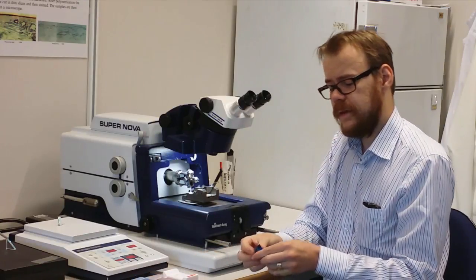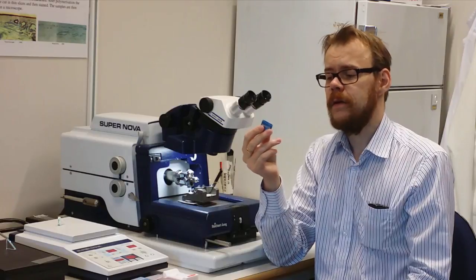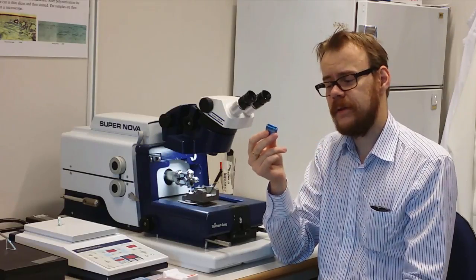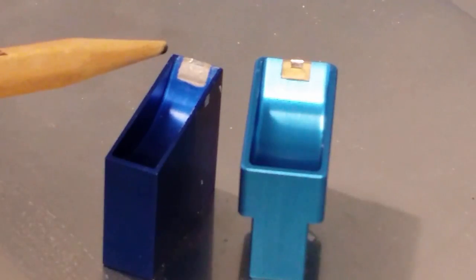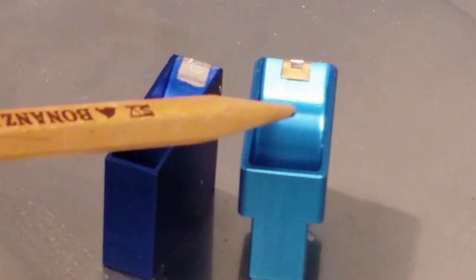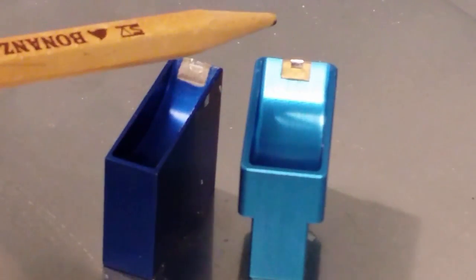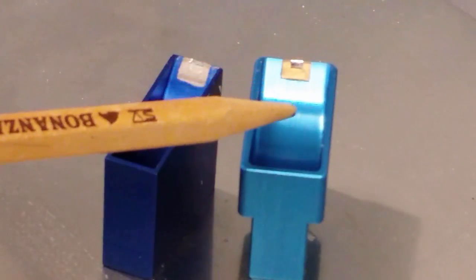The other thing you can use is diamond. This is a diamond knife, and it actually has a small cup here which is filled with water. I will show you later why you do that. Here you can see two diamond cutting boats. As I said before, this cup here is filled with water. That is because when you cut and the sample will slice, the slice will float up on the surface here of the water. Makes it more easy for you to pick it up.